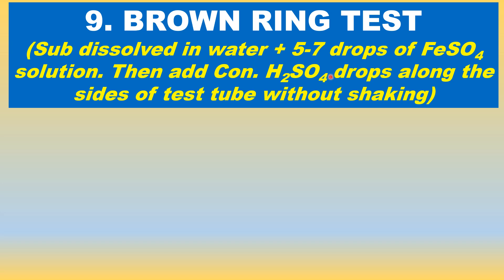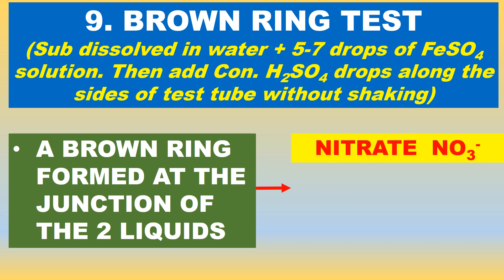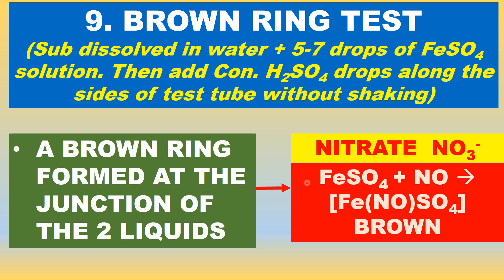Then add concentrated sulfuric acid along the sides of the test tube without disturbing, without shaking. A brown ring is formed at the junction of the two liquids — aqueous and concentrated sulfuric acid — and that is due to the nitrate salt. It is due to the formation of NO (nitric oxide), which binds with FeSO4 (ferrous sulfate) to form a complex that is brown in color, forming a ring at the junction of the two liquids.